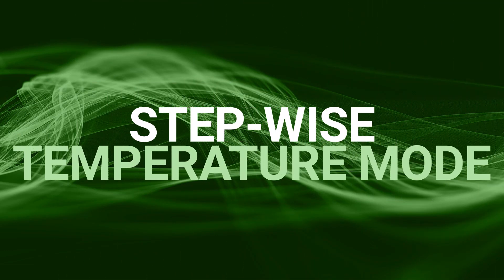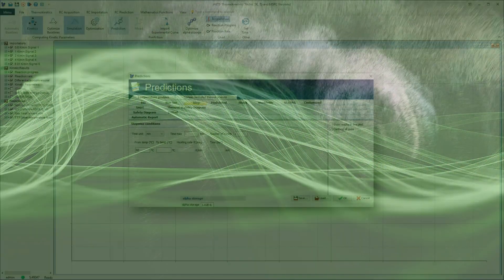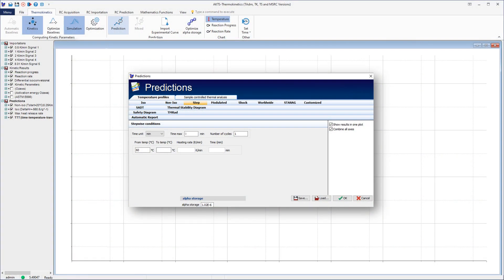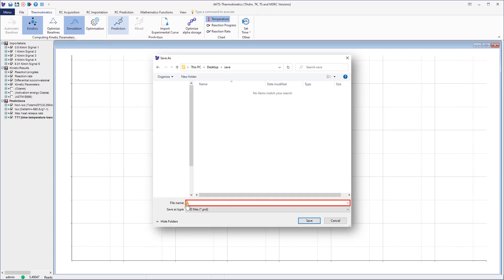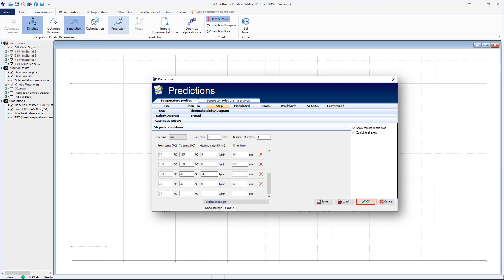Stepwise Temperature Mode. Select the Step tab to begin the simulation of the reaction rate and progress under stepwise temperature variations. To build the stepwise temperature program, use the Tab key to enter the required temperature profile and enter the parameters for all chosen temperature zones. Save the stepwise temperature program as a PRD file after introducing all parameters. Give your name for the stepwise program and save the file. To display the predictions, click OK.